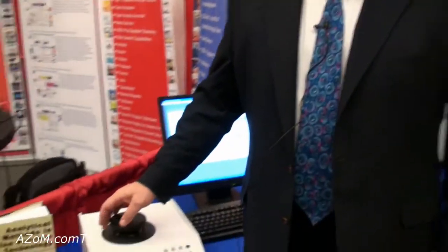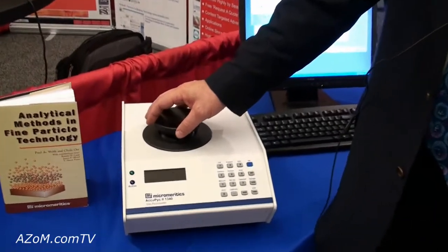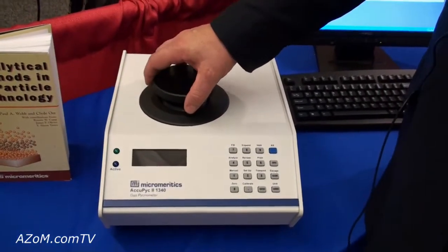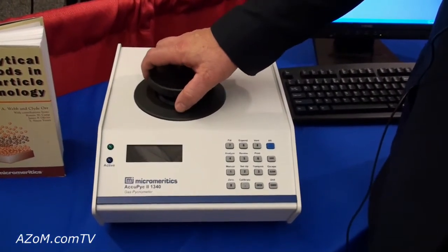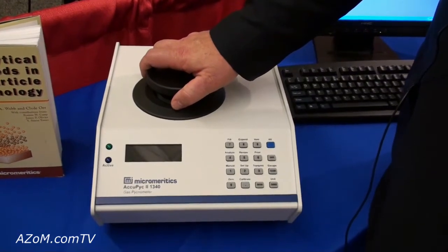Hi, the AcuPic 1340 is the newest line in our pycnometer series, pycnometers that are measuring density, true density by gas displacement.